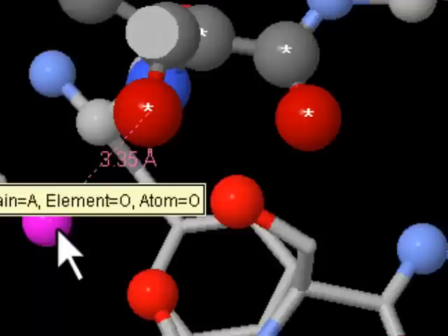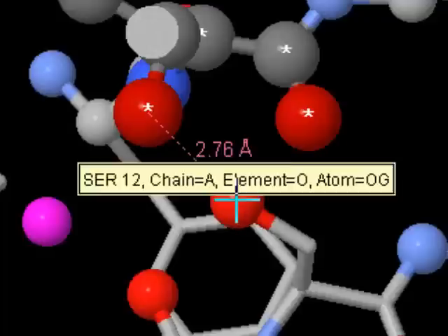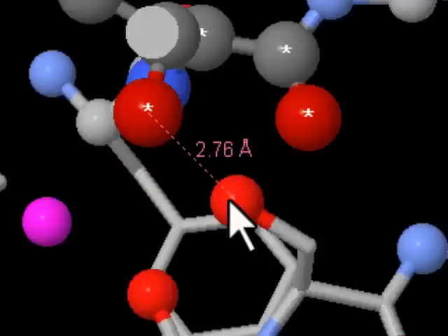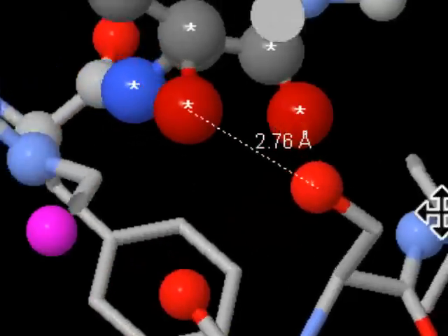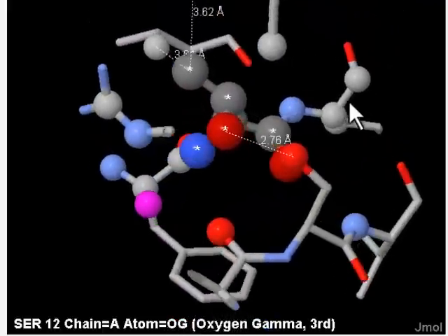And typically for distances lower than 3.5 angstroms, you would expect that there's a hydrogen bond going on or some other interaction. So this is the closest one, so that's the one that we'll mark up. It's part of the side chain of a serine, so the OH group of the serine and the OH group of the threonine come close together.